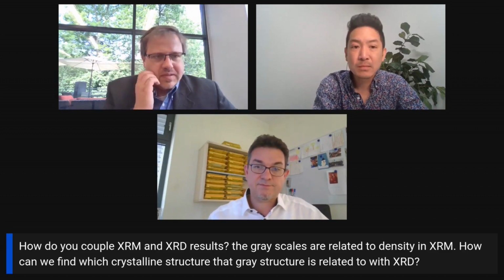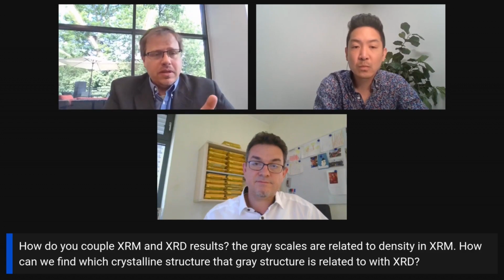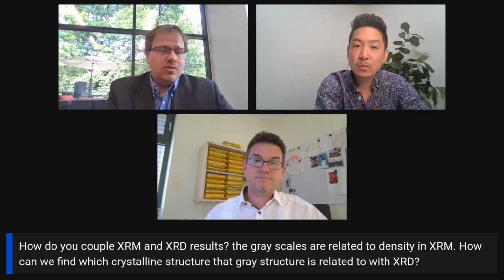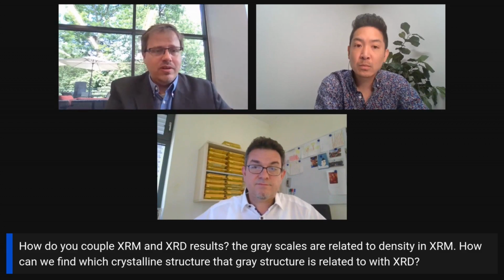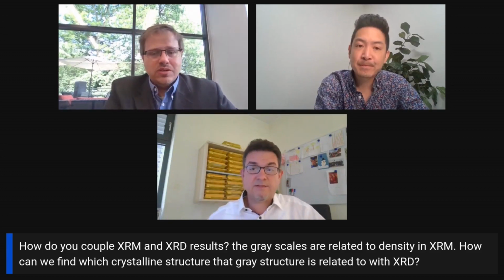I guess there might be some inspiration too from the world of geology. In that case, what people are looking at is two methods. One is looking at pure components. So you'd look at, say, the API, you'd look at the excipients, and then you would take that pure phase, throw it into the XRM, and you may be able to get some idea of that density contrast. What does it look like relative? The other bit is, if you do have the mixture, you could certainly do quantitative analysis. You could segment the whiter areas, the grayer areas, the darker areas, and then compare that quantitative analysis to your XRD quantitative result, and you may find some very strong correlations.